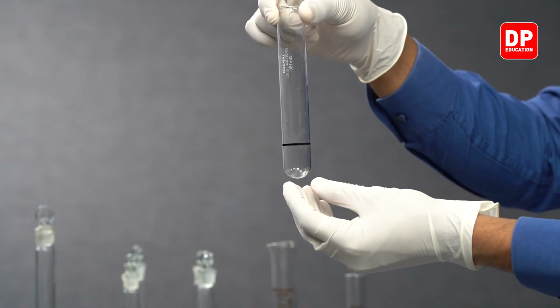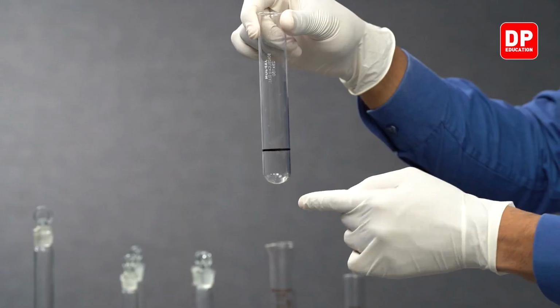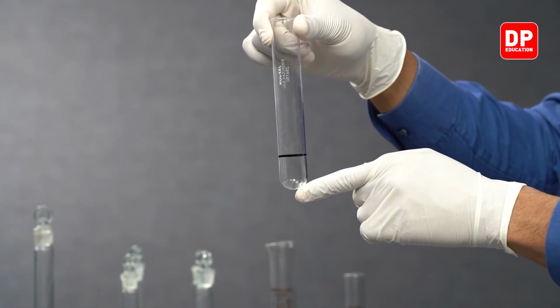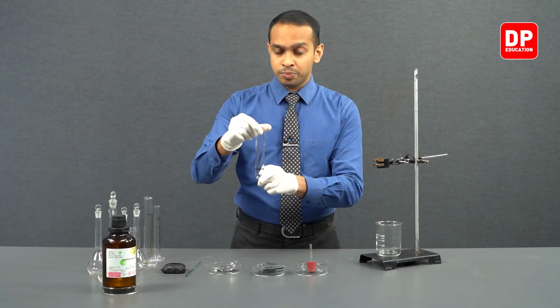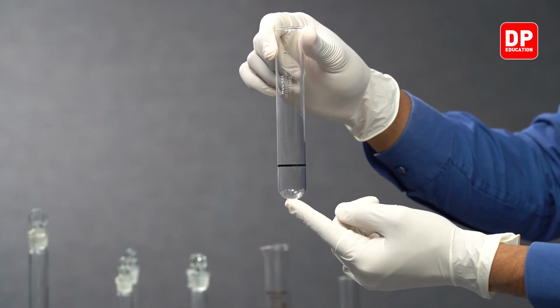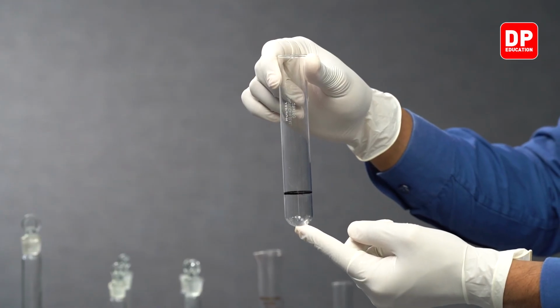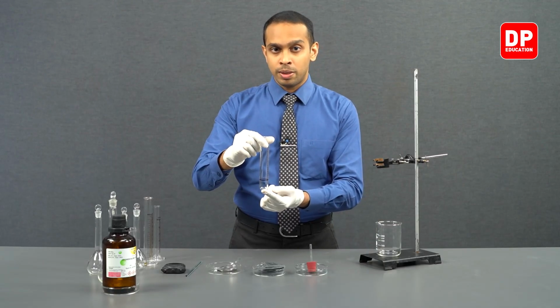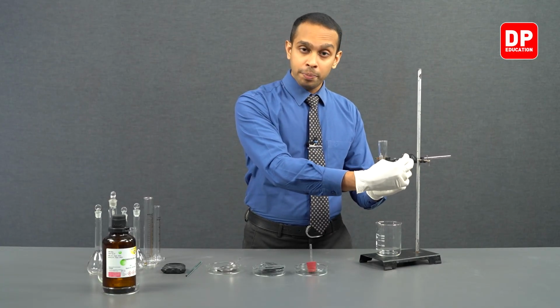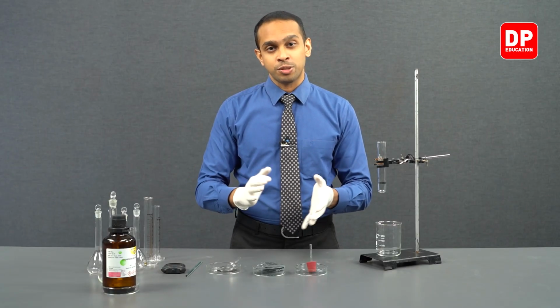So you would need a boiling tube where a line like this is drawn so that you can collect a constant amount of hydrogen gas when you are conducting this experiment. These are the equipment and the chemicals that you will be needing for this experiment.